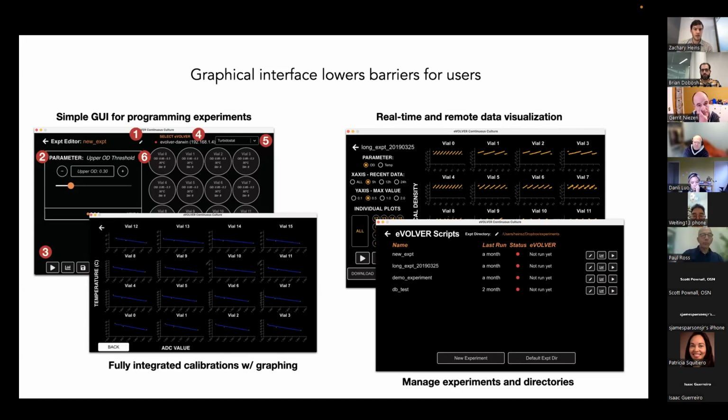On the top left, you have a way to set up your experiment, interface with it directly, turn things on and off, see what's currently coming on and off the system, do calibrations, view data, and manage your experiments. And this is all stuff that's also changing. I think they just got a grant to push this work forward a bit more, because I left and I was the only one working on this. So now they have professional software developers who are trying to make more UIs for the system and make it better.